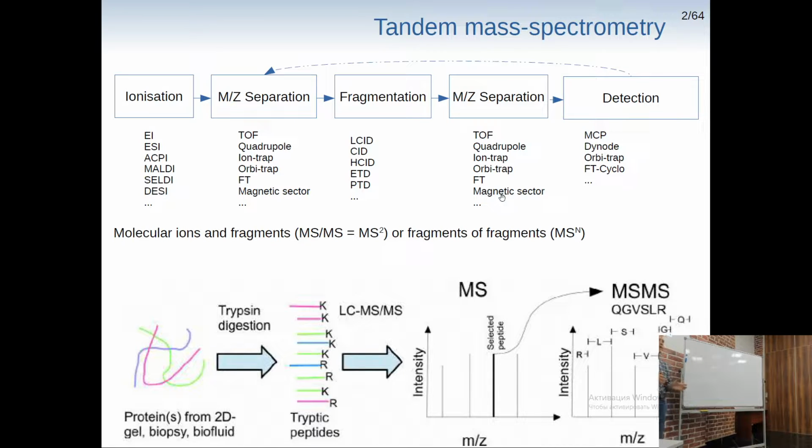It's a secondary amine also, so it has a structure which can just regroup, and we will actually lose this fragment from interpretation. It's the so-called proline gap. So if you ever encounter this abbreviation, proline gap, in mass spectrometry, we now know what it is.